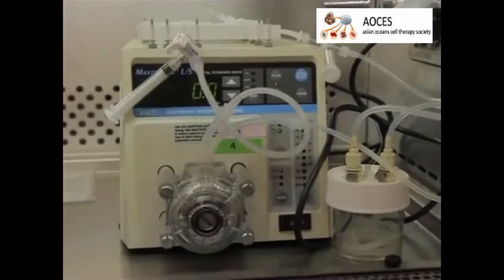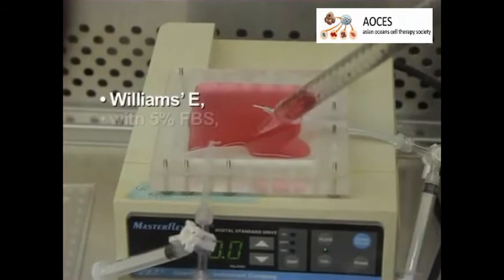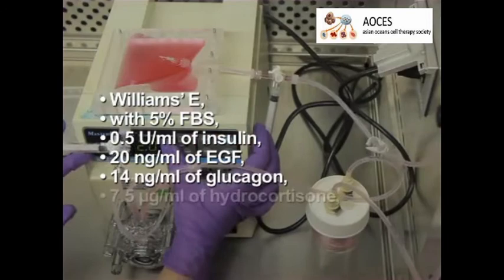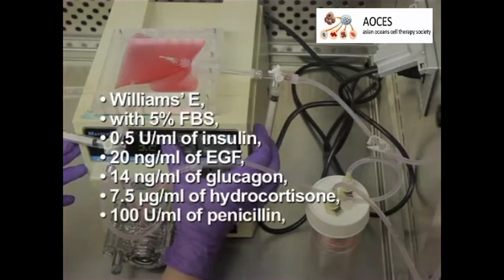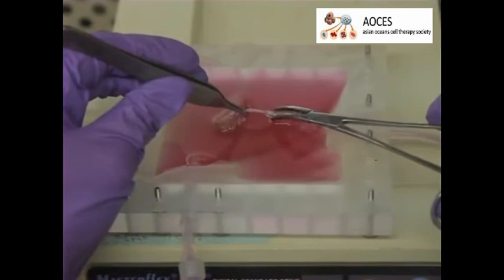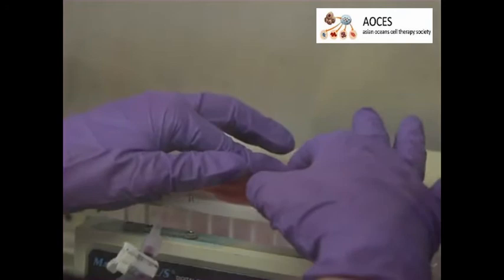To culture a recellularized liver graft, set up a sterile perfusion system that includes an oxygenator. Fill the perfusion system with 50 milliliters of culture medium such as Williams E with 5% FBS, 0.5 units per milliliter of insulin, 20 nanograms per milliliter of EGF, 14 nanograms per milliliter of glucagon, 7.5 micrograms per milliliter of hydrocortisone, 100 units per milliliter of penicillin, and 100 micrograms per milliliter of streptomycin. Place the recellularized liver graft into the perfusion chamber and connect it to the perfusion system through the portal vein cannula while the pump is running at 5 milliliters per minute to avoid formation of any air bubbles.